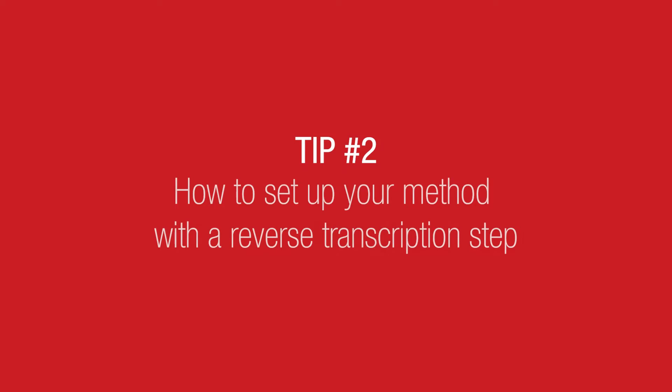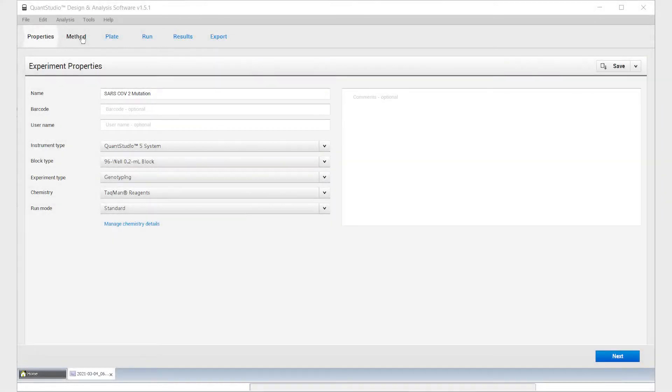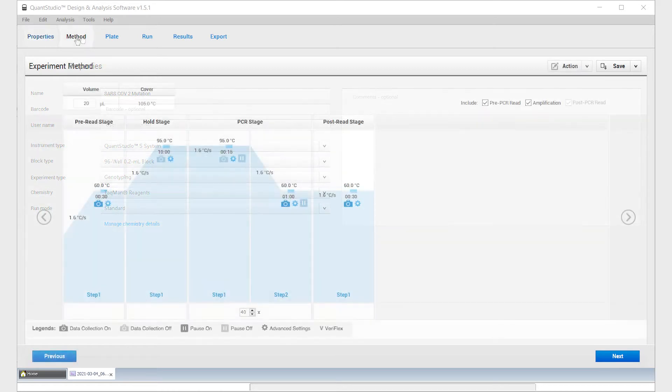Tip number two, how to set up your method with a reverse transcription step. Click on Method at the top of the screen to set up your method.